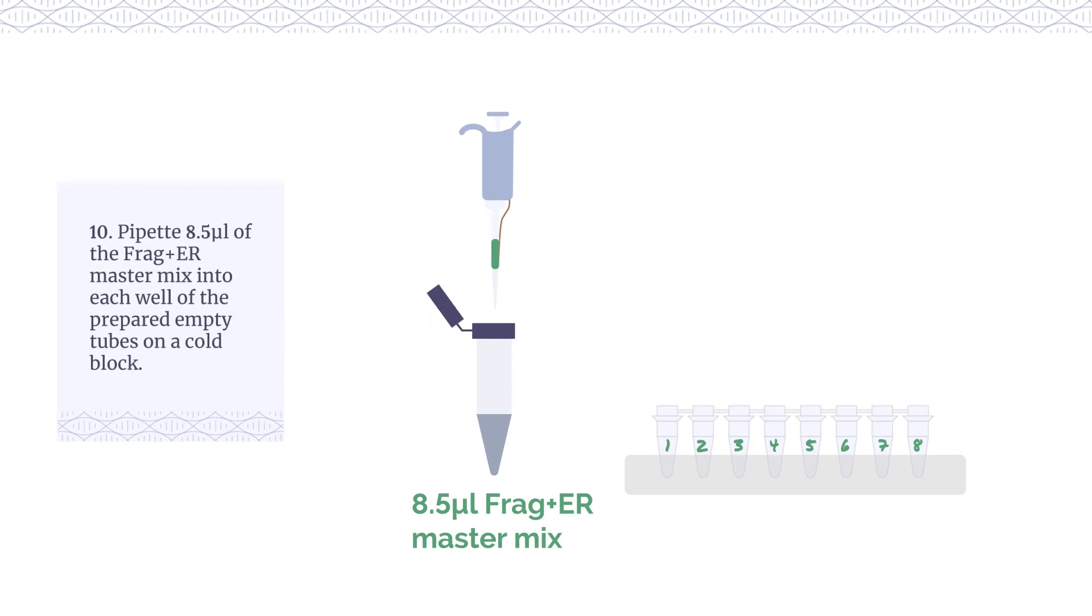Pipette 8.5 microliters of the Frag Plus ER master mix into each well of the prepared empty tubes on a cold block.